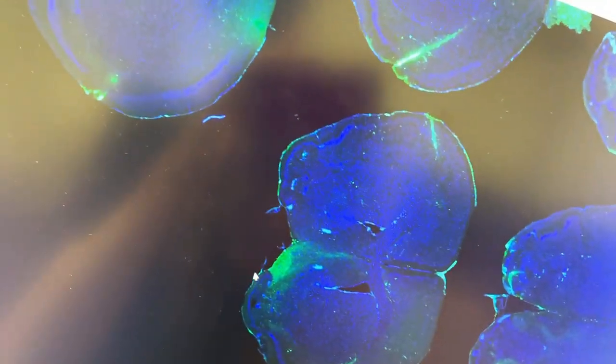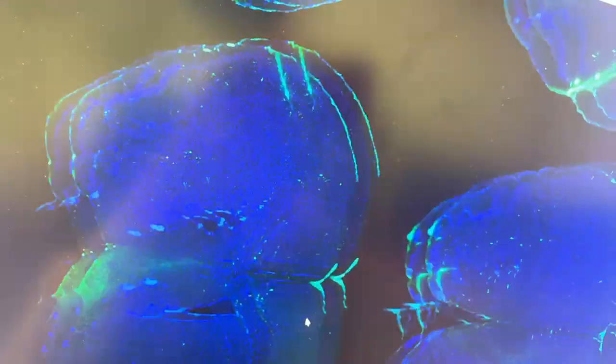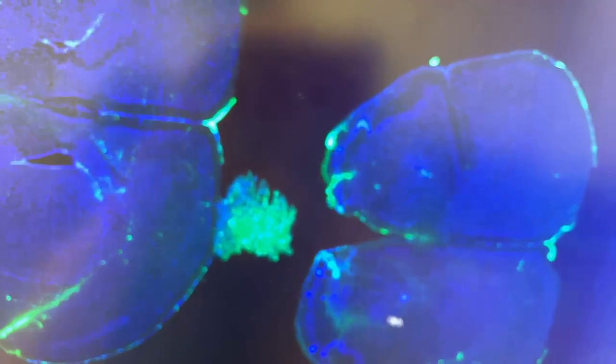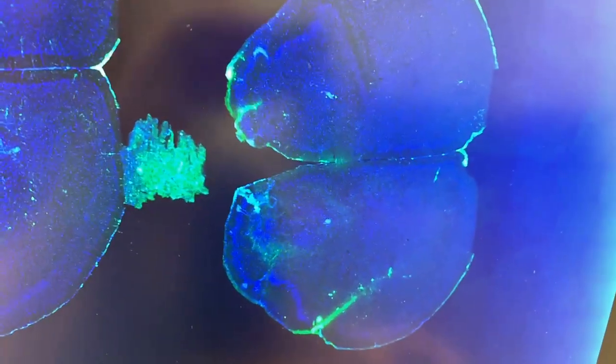Okay, how many of these are actually usably in focus? That's not really. Is this kind of in focus? That's in focus. See, you got fibers. So that's in focus. That's in focus. That one's not. That one is.